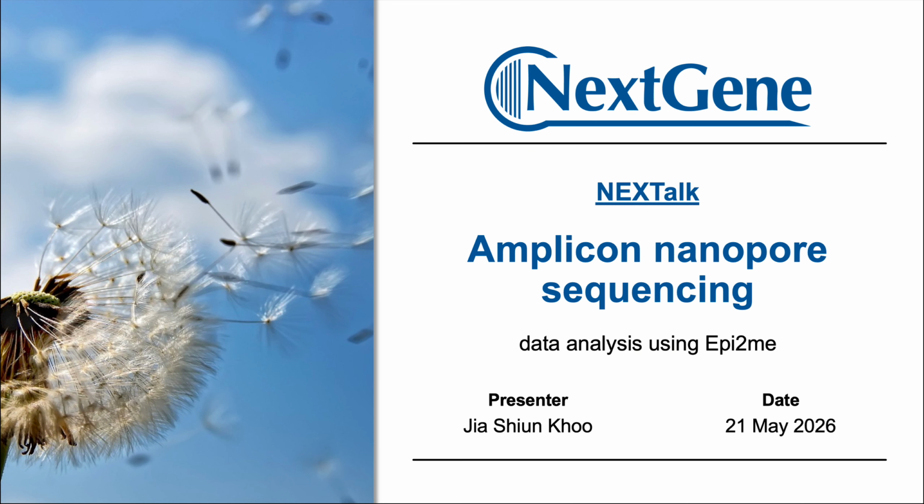When we amplify the 16S, we can identify the species, but the relative abundance information is not available, not because the sequencing throughput is not enough, but because the sample is supposed to contain only one species. I hope that answers the question.